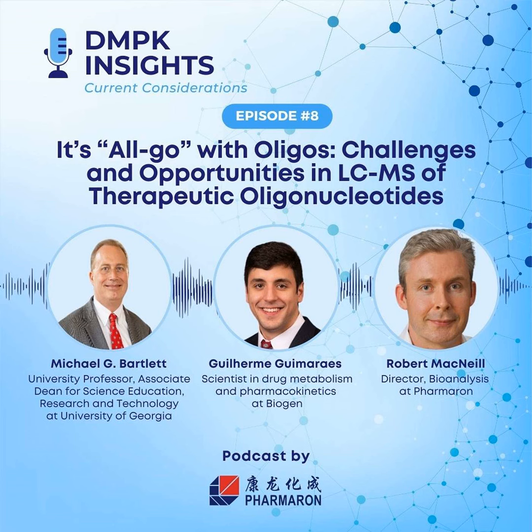And I think we really need to understand that on the retention side, really, before we're going to make a lot more progress there. Yeah, I've noticed that too, I must say, with the HILIC gradients that I've used in my groups personally, observing elution of the oligos at about 50% aqueous. So yeah, you have to think at that point, is it really classical HILIC as outlined years ago, or is it something else? Yeah, I think it's something else entirely. I think it's a whole different type of retention than we have in any other type of chromatography. Yeah, so a lot of interesting research to come.